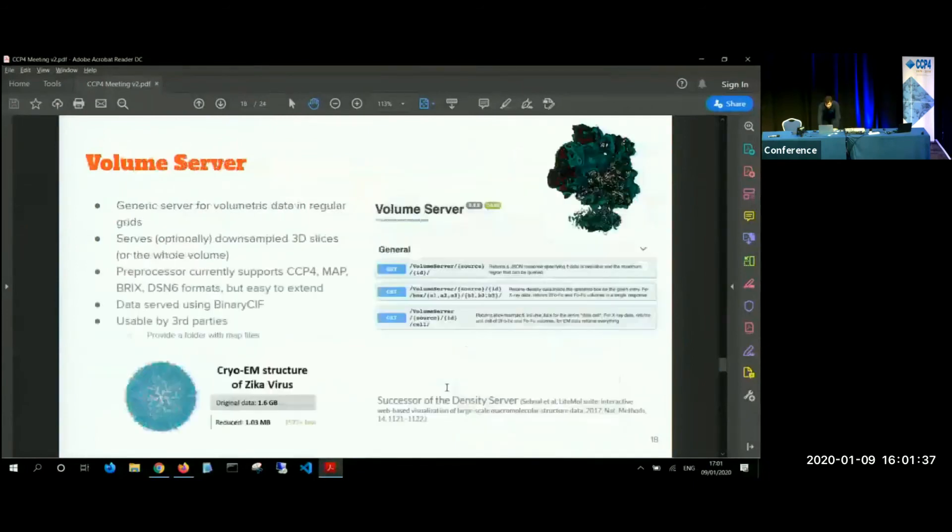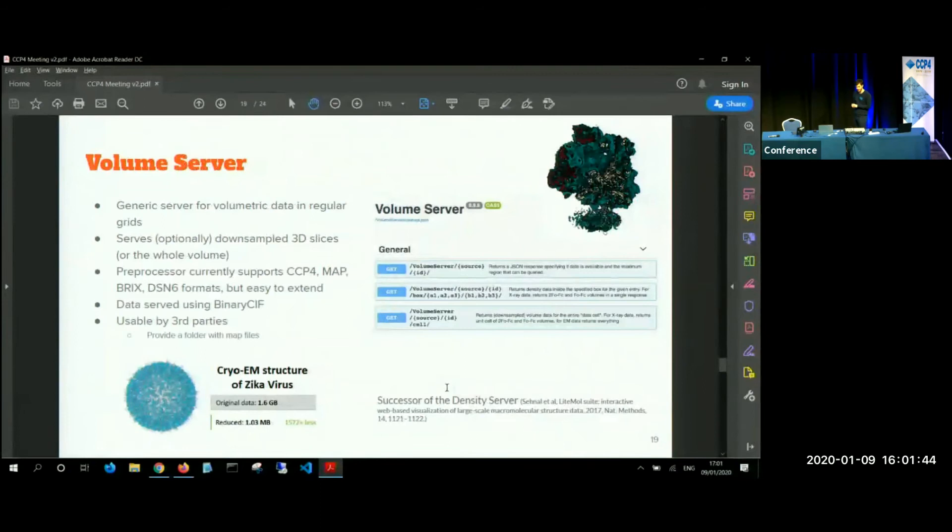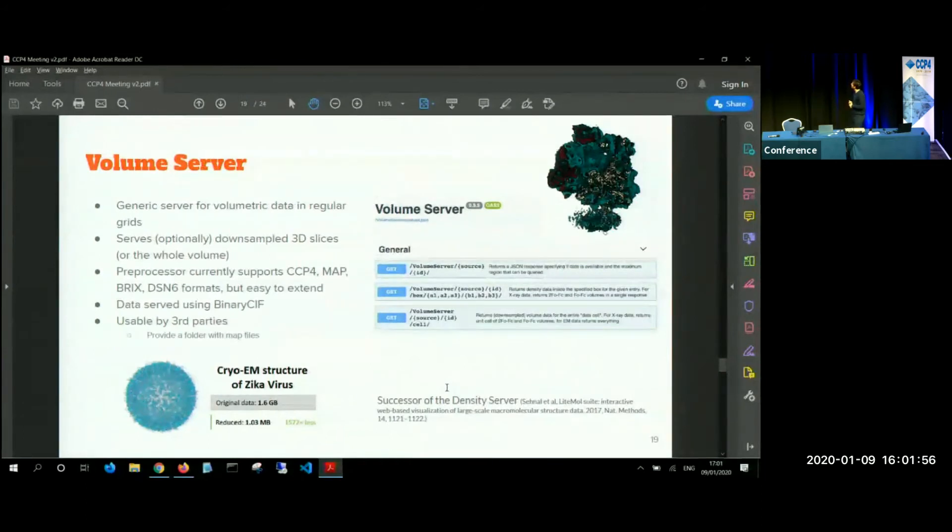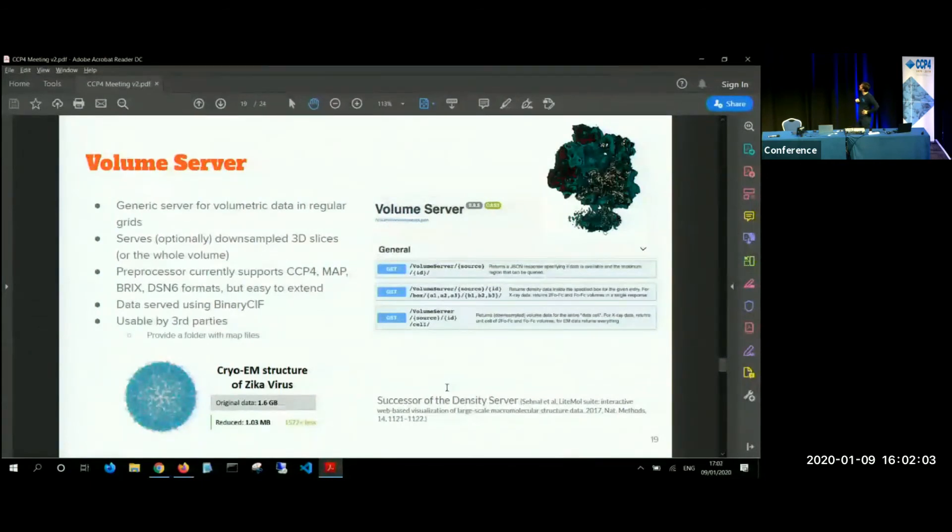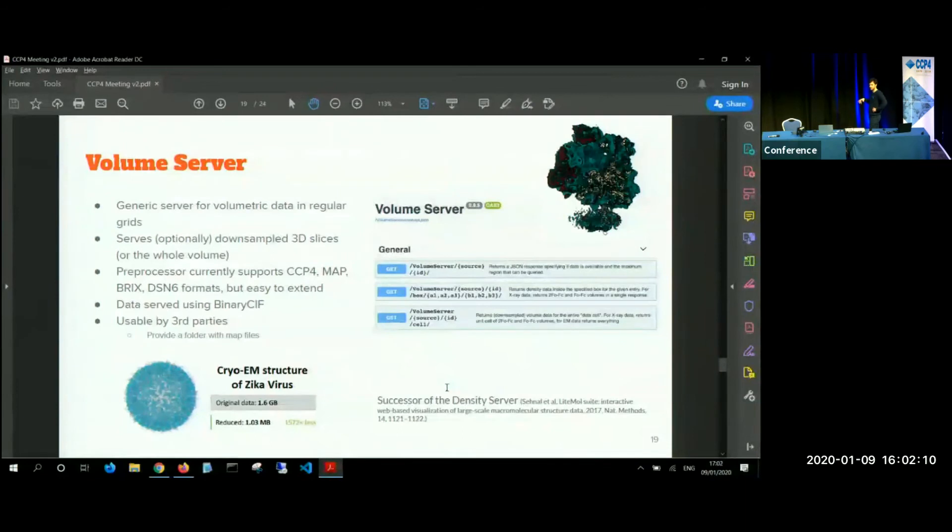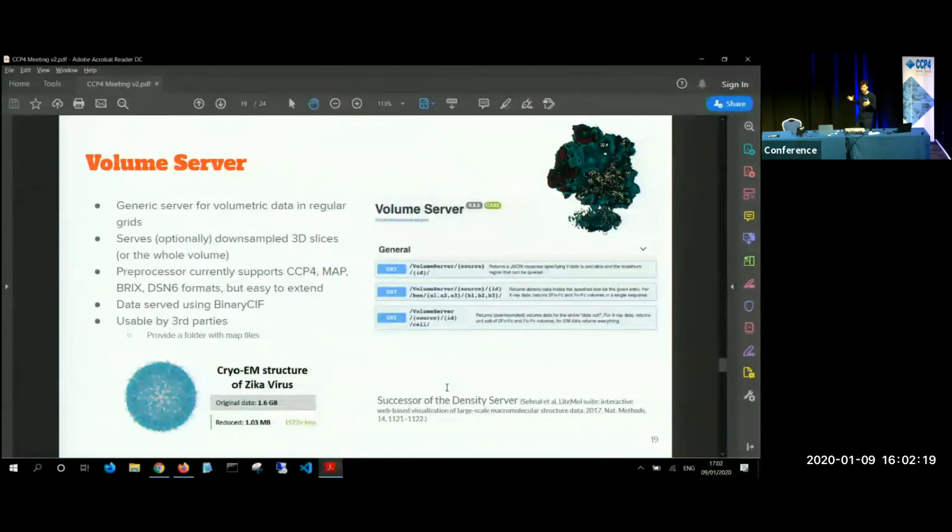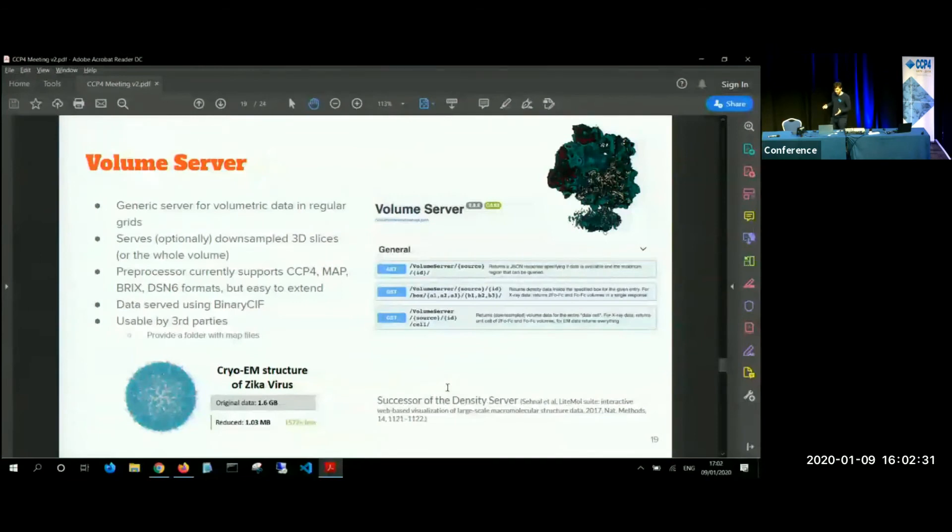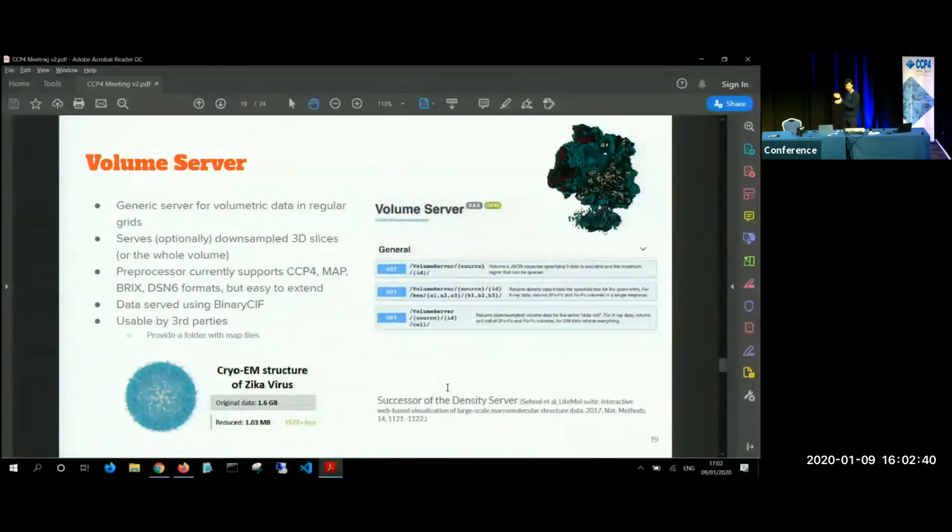Now to get to the data, to the server, to the client, we have two servers. One is volume server, which is a service for serving volumetric data and regular grids. So it's like crystallographic and EM densities. It serves the data in optionally down sampled 3D slices and it supports currently the CCP4 map, BRIX and DSN6 formats, but it can be extended to multiple formats. It supports multiple channels and stuff like this. And it's usable by third parties. Basically, if you have a lot of EM data in your lab and you want to provide it to the users on their laptops immediately, all you need to do is provide a folder with the maps and run a simple conversion utility. And then you can use it. The use case that I like to use is the cryo-EM structure of Zika virus, which would be 1.6 gigabyte of CCP4 data even compressed. And if you want to show the picture, it is enough to send just one megabyte and have it shown immediately.